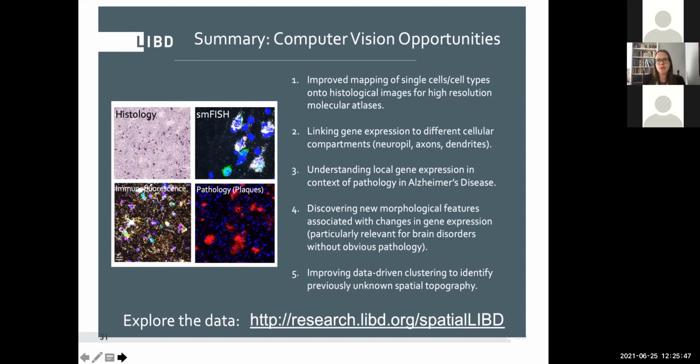As spatial transcriptomic assays continue to increase in resolution and multiplexing, and they begin to include more multi-omics data, I think you'll see more and more opportunities for incorporating the corresponding microscopy data. I think the field is really just getting started with this.